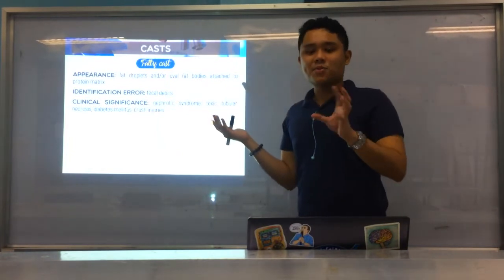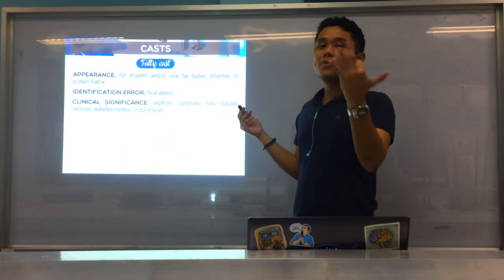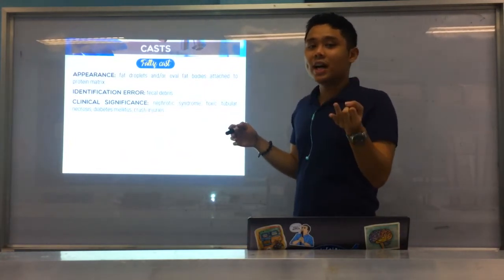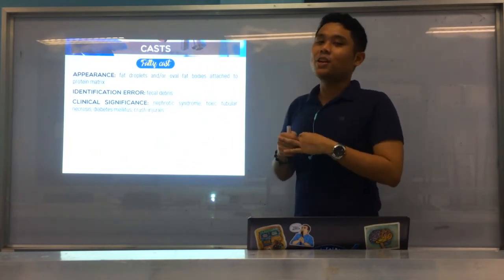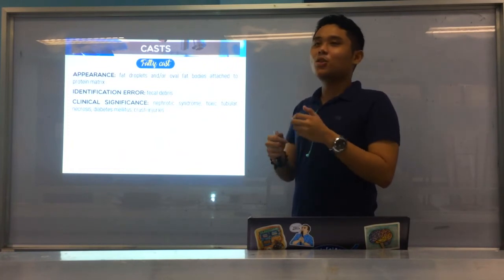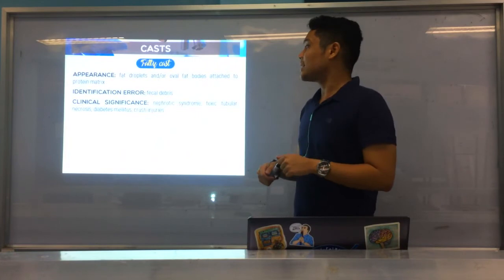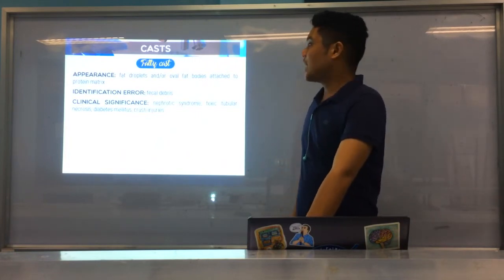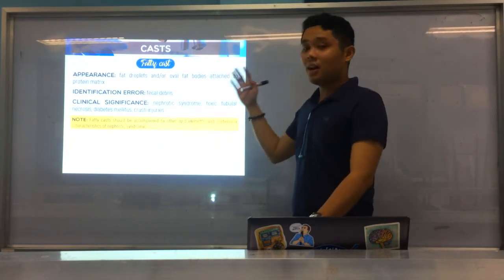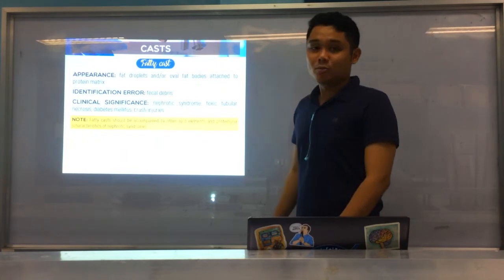Unsay mga different types of fats na pwedeng naa siya, you have your triglycerides, neutral fats, or cholesterol. And how do we differentiate them? We stain it with Sudan 3 or oil red O. Ang mo-stain sa Sudan 3 or oil red O, the triglycerides and neutral fats. And kung naay Maltese cross in polarized microscopy, you have cholesterol. Okay, so that's for fatty casts. And again, the fatty cast should be accompanied by other lipid elements and proteinuria para makaingon jud ka na nephrotic syndrome siya.